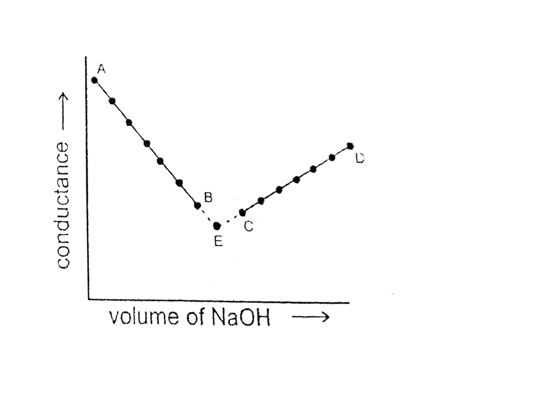It is getting decreased because the number of H plus ions is getting decreased. Then it reaches a point where all the H plus ions taken in the beaker become completely neutralized. From then, in the graph, A to B, C to D: C to D represents the OH minus ions.